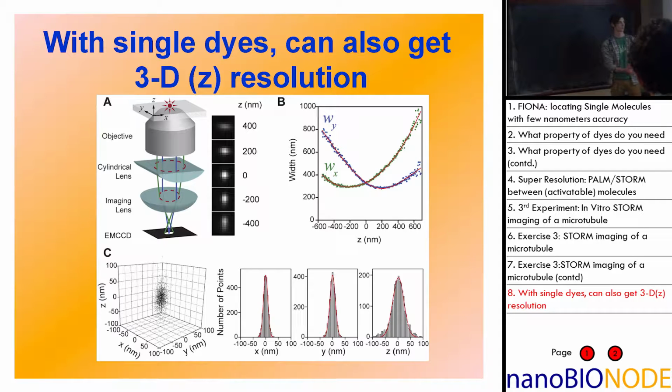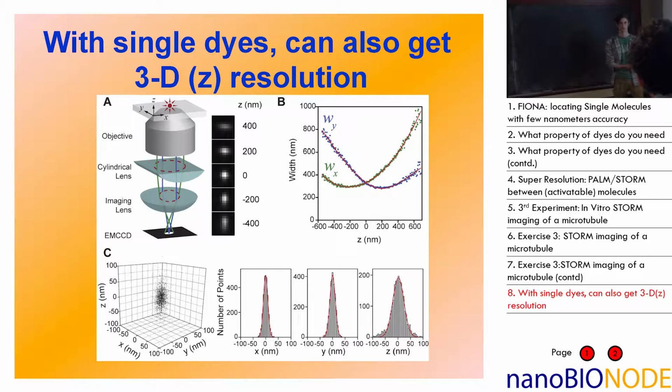I'm kind of uncertain, but I think you can use your level of precision measured from the in-focus plane as a point of reference. You can use the changes in the full width at half maximum to generate the change in z. Okay, that's very, very close.